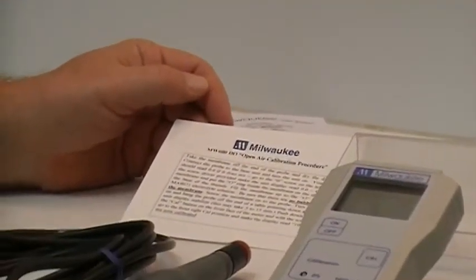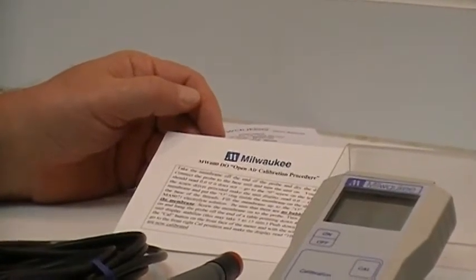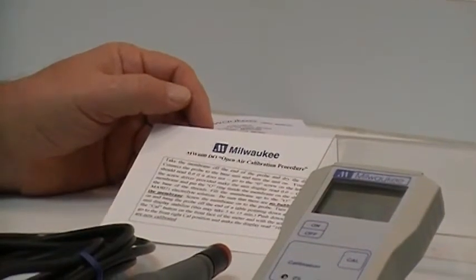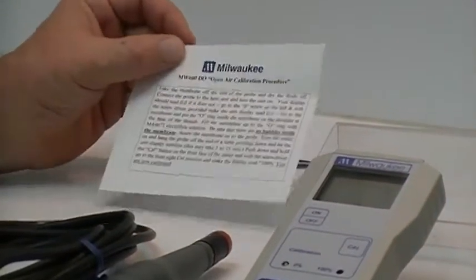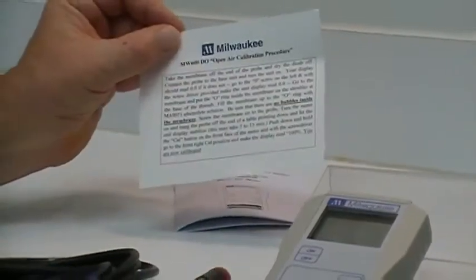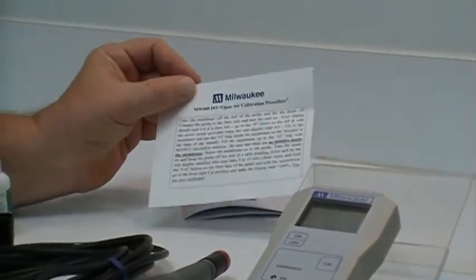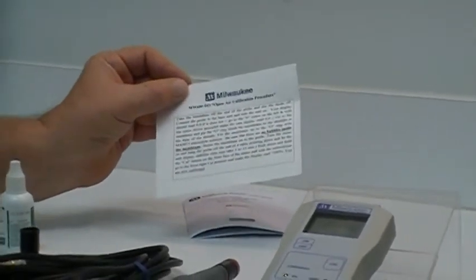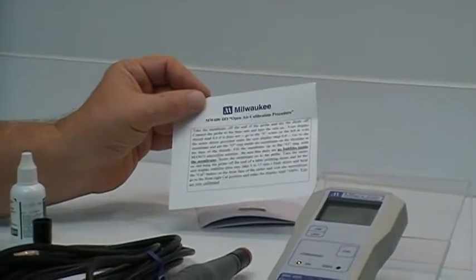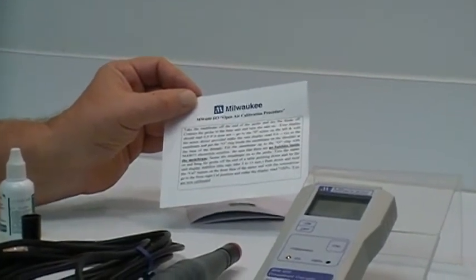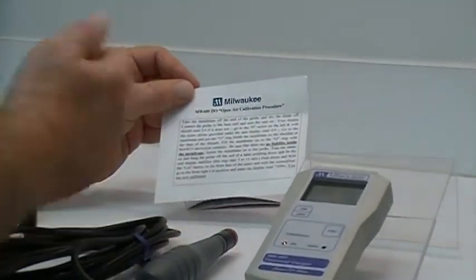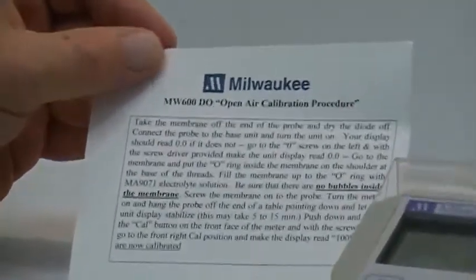Also included with your unit is the MW600 dissolved oxygen open air calibration procedure card. This is the open air calibration procedure that we would like for you to proceed with rather than what's in the manual. This is much easier and just as precise. The only reason for going to the manual using the zero oxygen calibration procedure would be if it is specified that you must have the zero oxygen to calibrate the unit. So we're going to be following these short instructions today and walking through step by step.